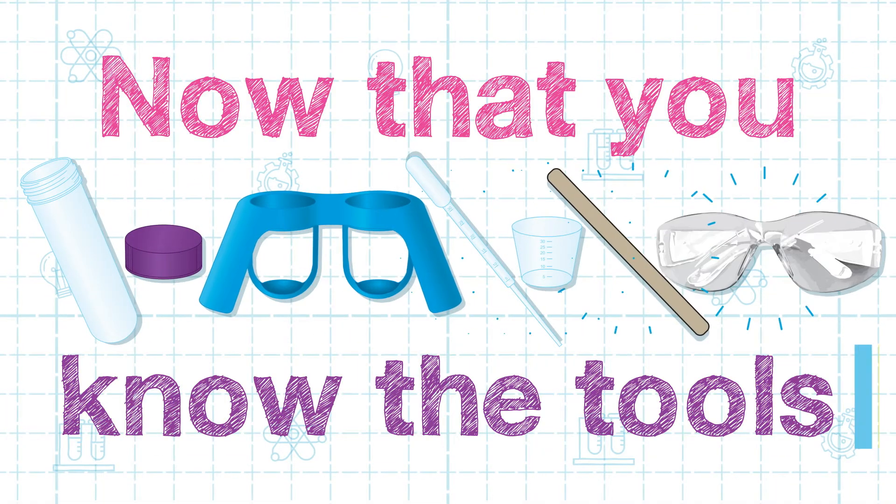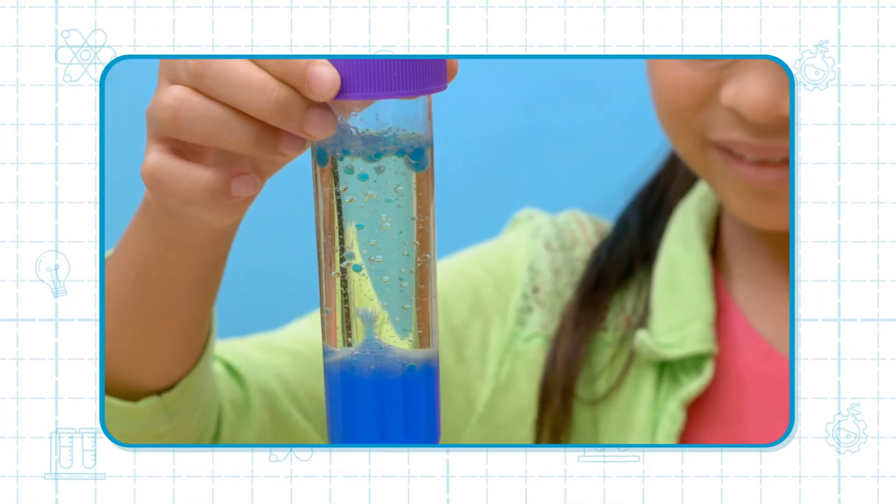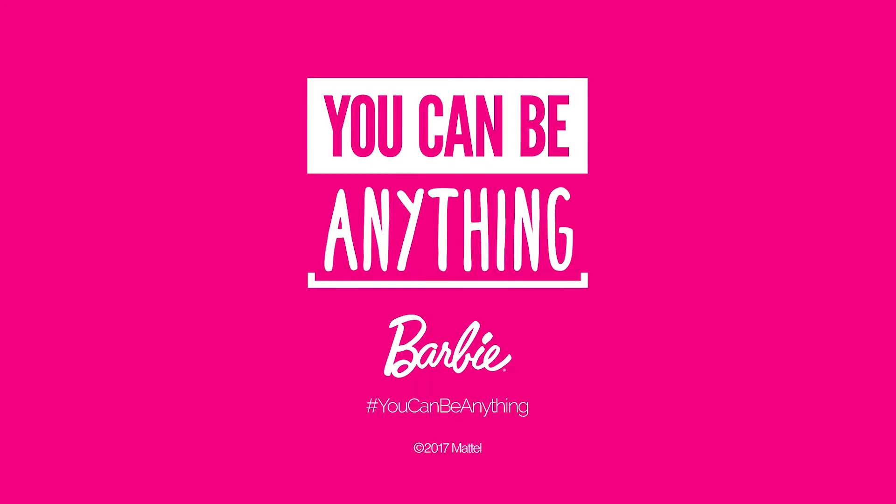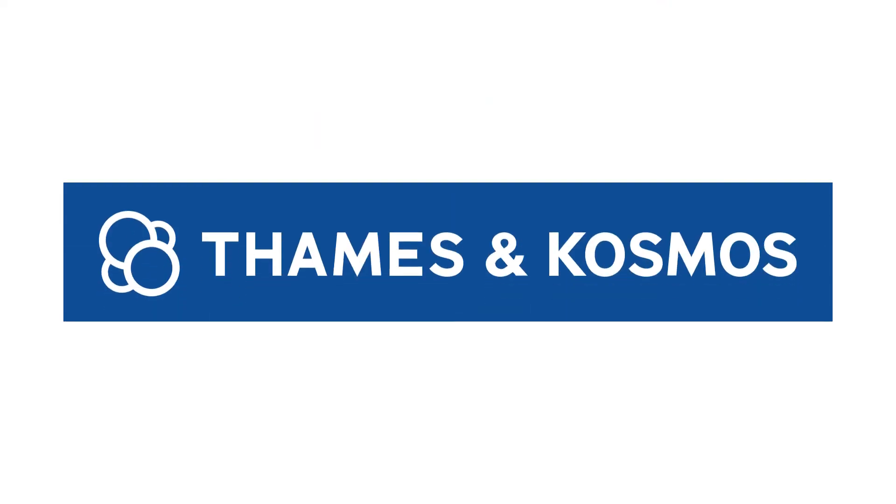Now that you know the tools, you are ready to start experimenting with the Barbie Fundamental Chemistry Set.